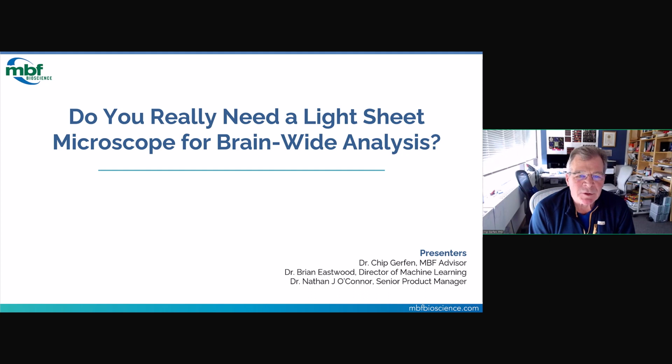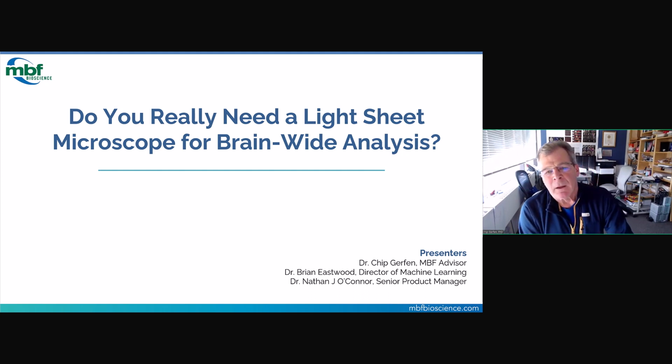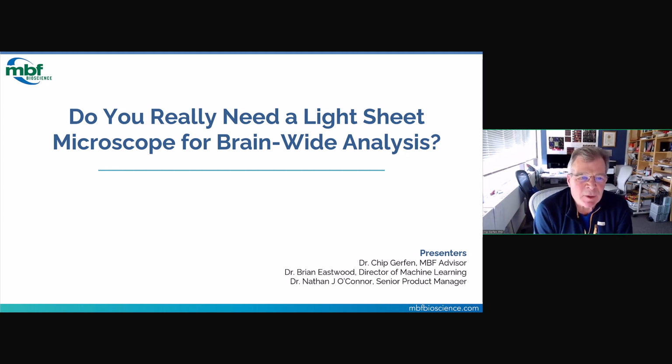So what I'm going to describe today is using the NeuroInfo program to map serial sections into the standard atlas. There are many histologic techniques that may be used for this sort of thing, and one of those is using light sheet imaging, so that whole brains can be imaged.